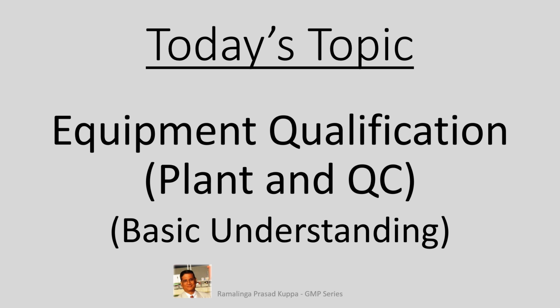Today's topic is equipment qualification for plant and QC areas, the basic understanding.